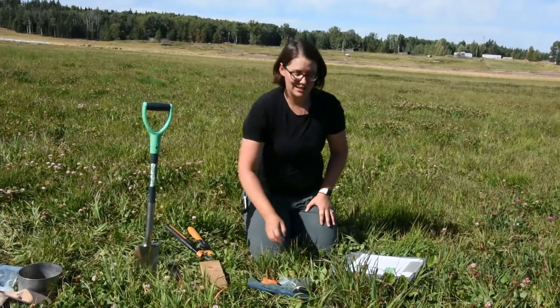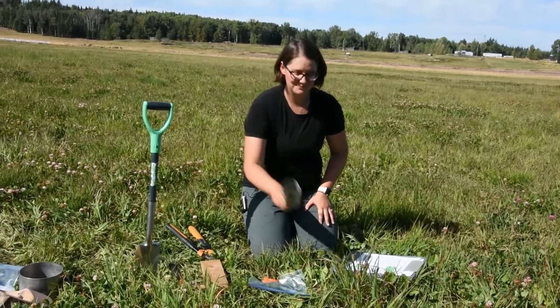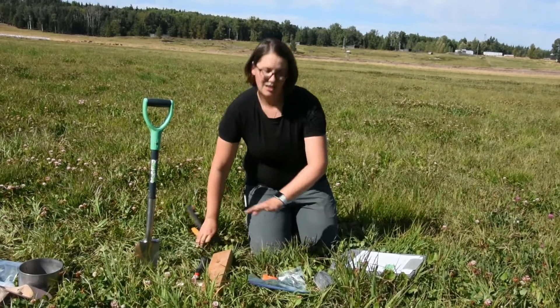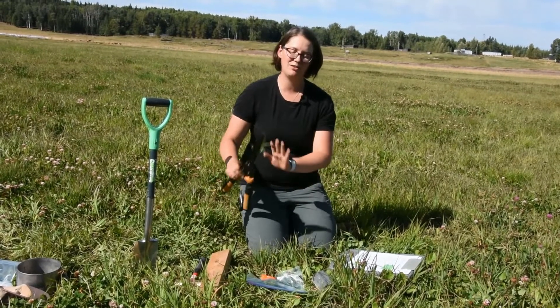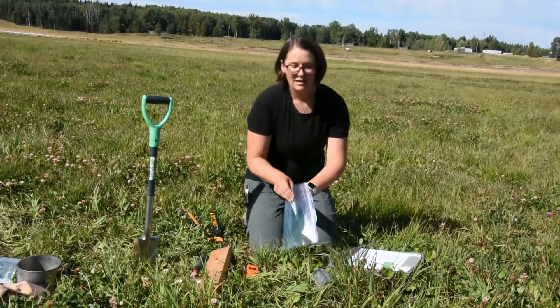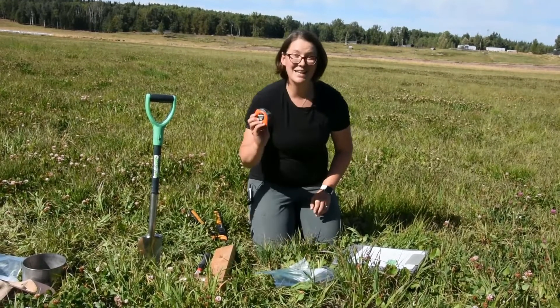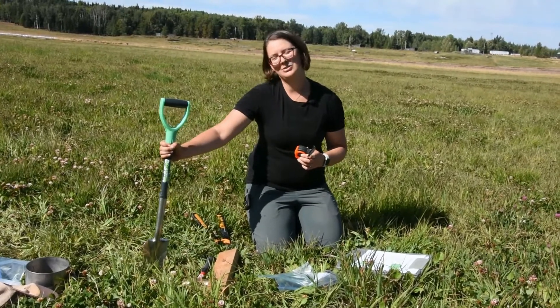For this test you're going to need your smaller three inch diameter ring, a way to get it into the soil — so a sledgehammer and a block of wood. If you're working in a forage field or any vegetative cover you need some clippers to clear the vegetation, a labeled bag with your name and the location on it, a tape measure, a butter knife, and a hand trowel or small shovel.